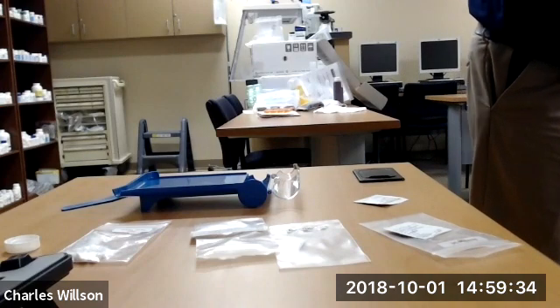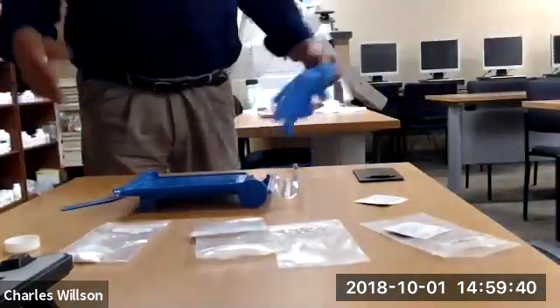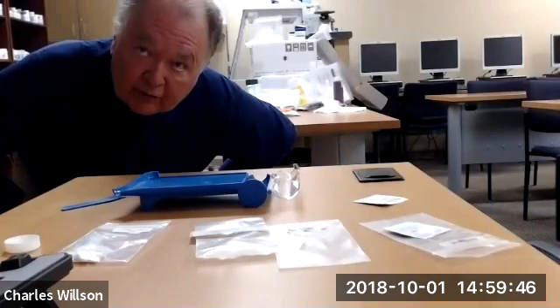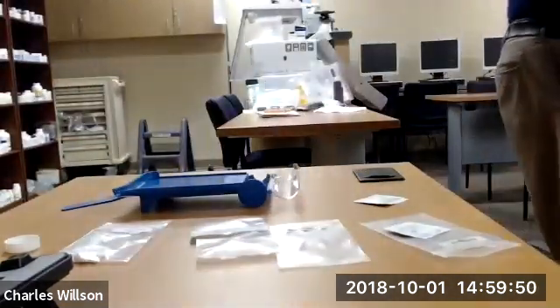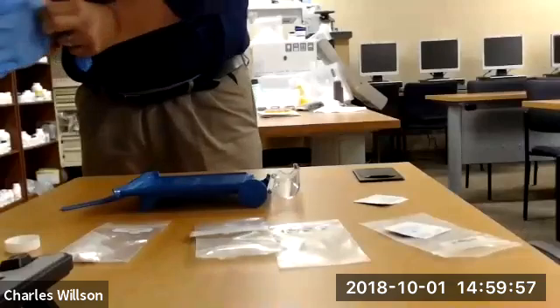starts out. Wash your hands using aseptic technique. There's no sink in here. Okay, so you're going to presume that I washed my hands, and I'm going to presume that you washed your hands. Okay. All right. Fine. And then gloves. Put your gloves on.